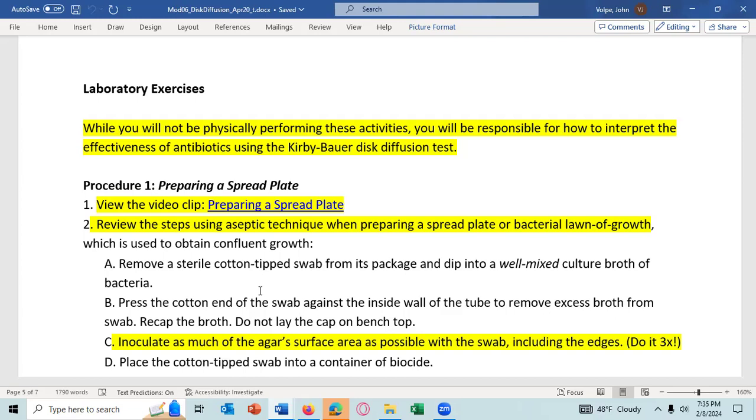And she came and she showed me the plate, and she said, how can I measure the size of the diameter of the zone of inhibition? And I looked at the plate and I said, well, you didn't get the bacteria to grow everywhere. You were supposed to swab the plate everywhere, and you didn't. You've got vast holes of air on the plate that have no bacteria. So you cannot measure the size of the zone of inhibition. And I told her she'd need to redo the experiment, or she could use the data from her lab partner.